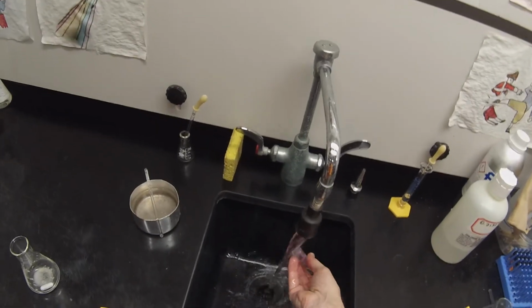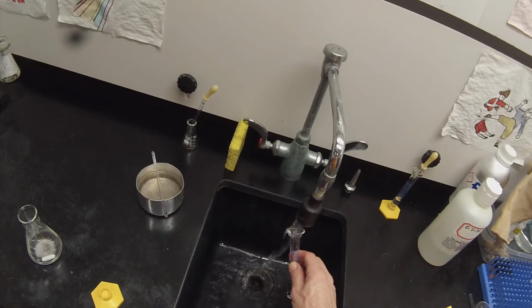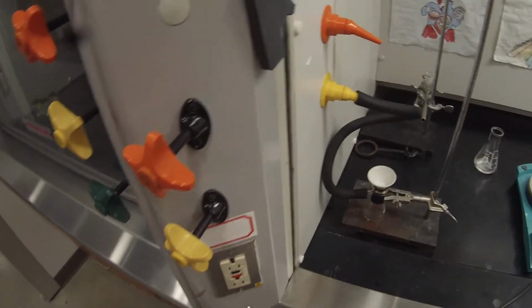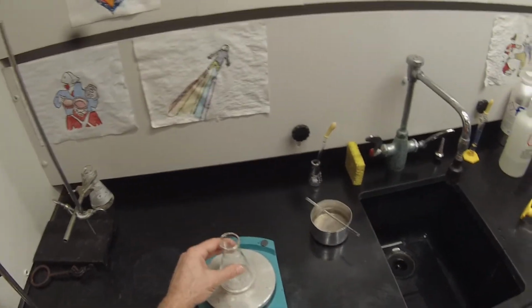No need to scrub that. We're just going to rinse that with water. Flush the rest of the acetic acid. Nice thing about a green synthesis like this is not a lot of organic waste being generated. And we're going to set that up on a stirring hot plate, the one that isn't still hot. And stir that. See if we can get that to start dissolving.